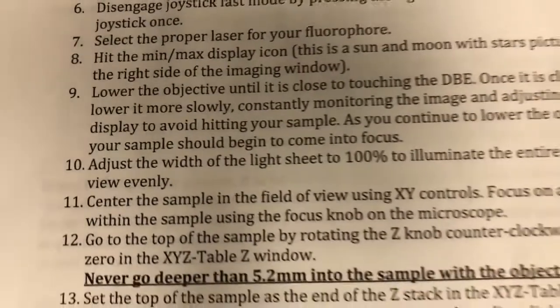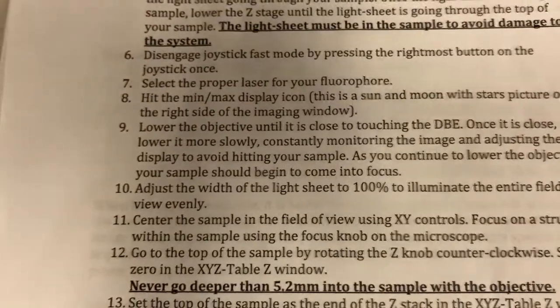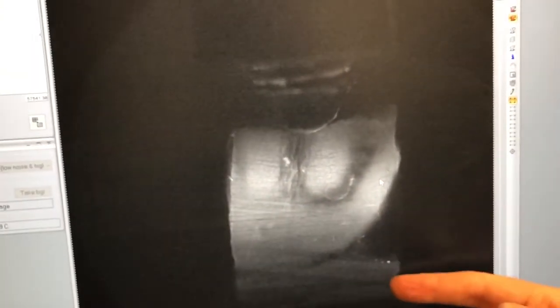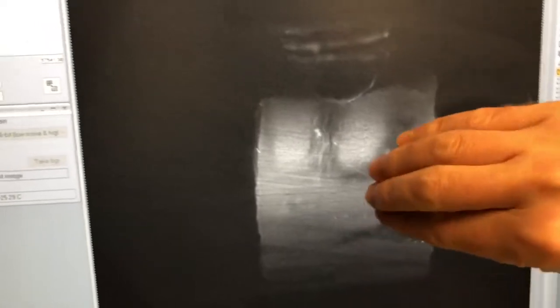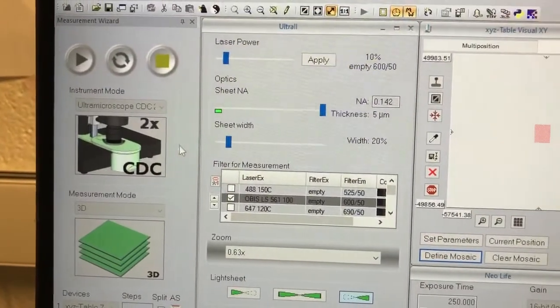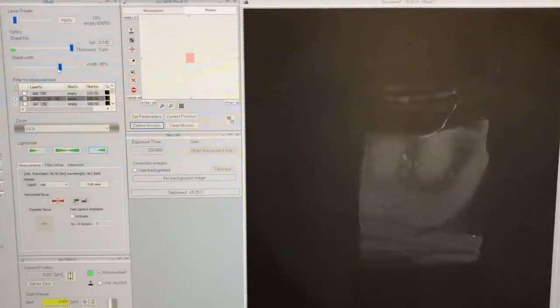Next, adjust the width of the light sheet to 100% to illuminate the entire field of view evenly. The sheet width refers to the width in the Y dimension. Right now, part of the sample is much better illuminated than the lower part — we don't want that. By moving the sheet width slider to the right, we distribute the light more evenly. The illumination gets more even but dimmer, because we're distributing the same amount of light over a bigger region.